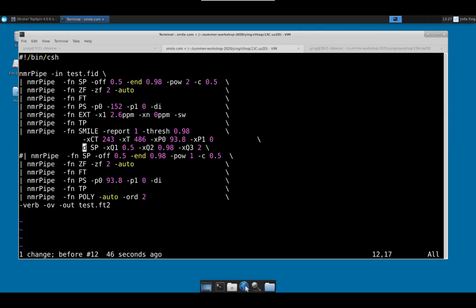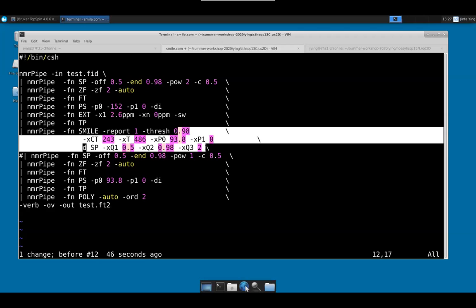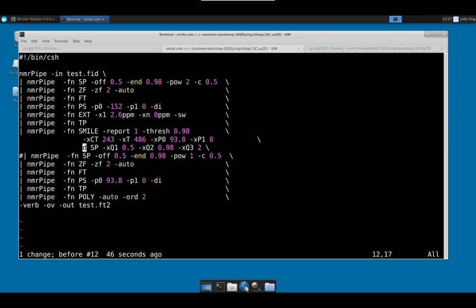And also, this scaling factor, depending on the linear phase, is automatically set by SMILE, and it's not undone, meaning that it's going to carry over to the later processing. So you really don't need the whole line over here. That's why I commented it out. Okay. So I'm not going to save this, although it's equivalent.